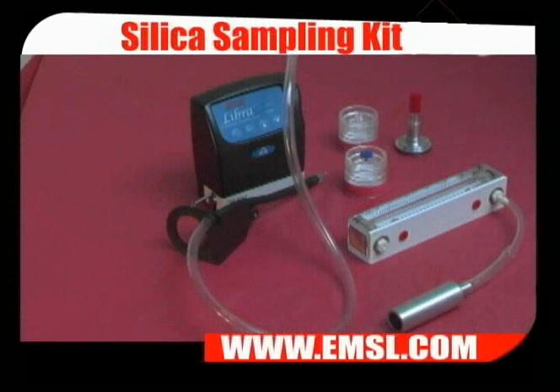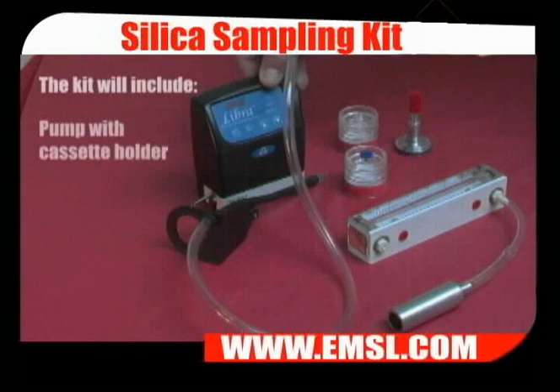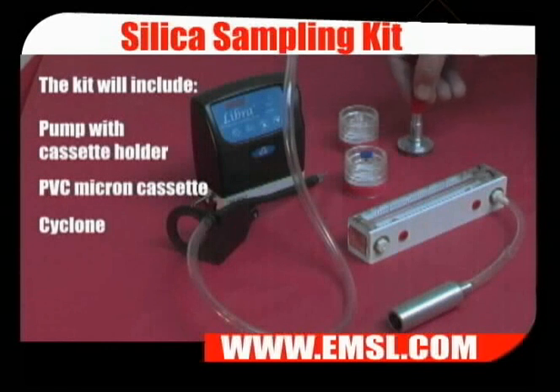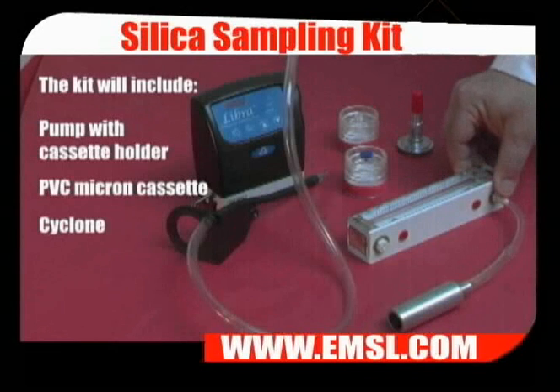The respirable silica sampling kit will include a pump with cassette holder, pre-weighed 5 micron PVC cassettes, a cyclone, and a calibrator with a cyclone adapter.